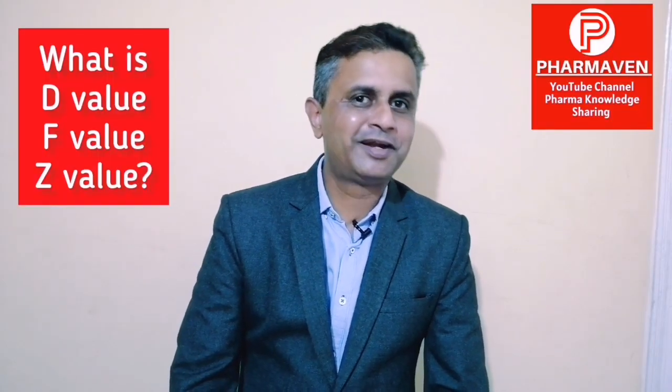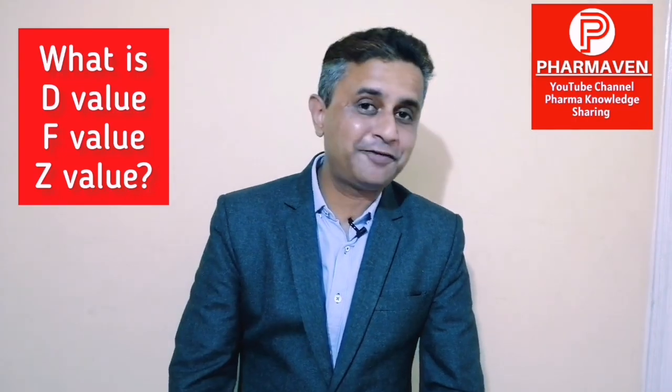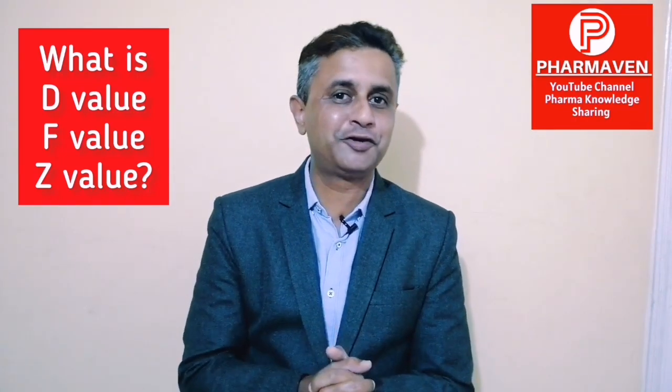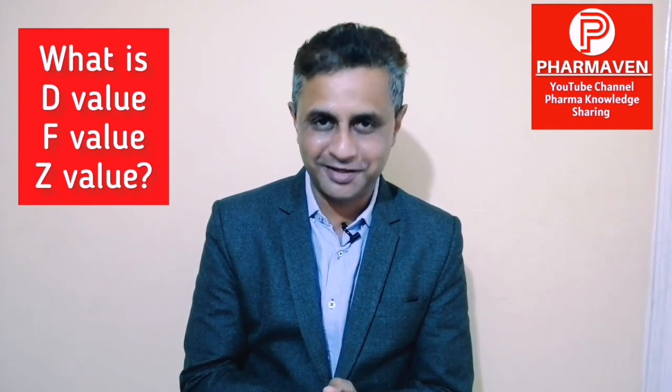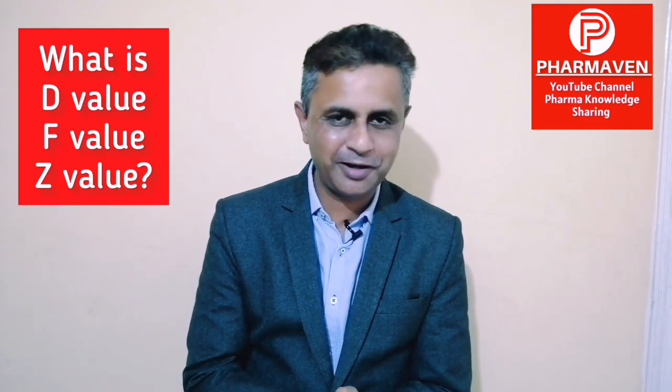In today's video, we will understand about D value, Z value and F value. These are very important terminologies when we are talking of sterilization. So let us understand one by one what is D value, what is Z value, what is F value, and all three are interconnected. There is no independent value.